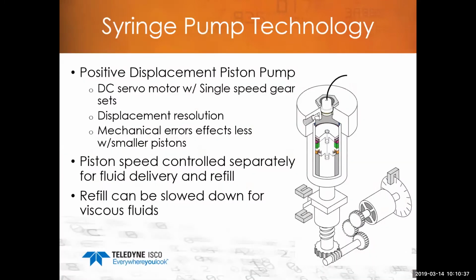So let's talk a little bit about the pumping technology. A positive displacement syringe pump can be considered a positive displacement piston pump.